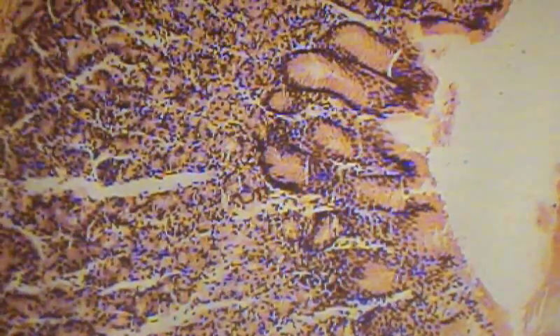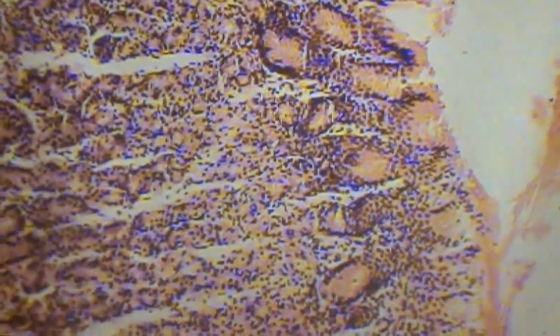that we don't want to worry about, but these gastric pits, imagine them like little tubes, if you will, little hollow tubes that extend into the mucosa of the stomach. Sometimes you split the tube lengthwise, and you can see the lumen inside of it.